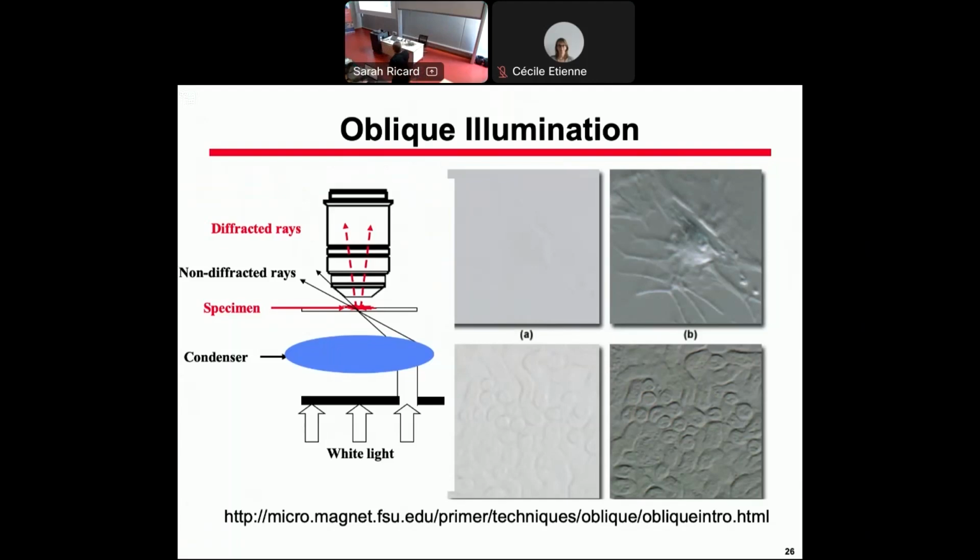But there is a false trick. In principle, all of you should see these as negative steps. Concave or convex. There is no relief in this picture. This is a transmission microscope. Why do you see this as a kind of pattern?